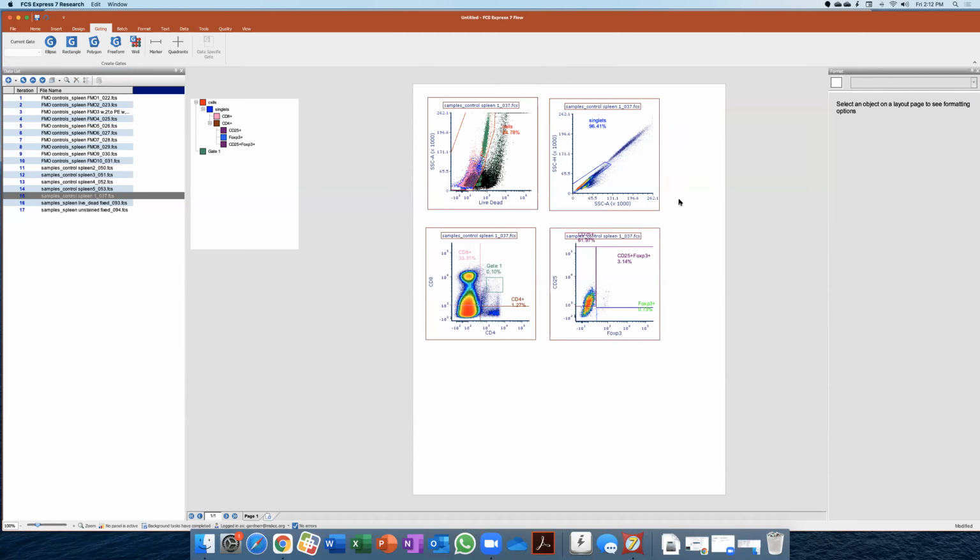And I just wanted to put in my 2 cents from a conversation a little bit earlier about FMOs and what samples to use them for. When you're developing a panel and starting out, typically you would recommend doing an FMO for each and every single marker in the panel, so you can make sure that you have enough cells at the onset to really test everything out.